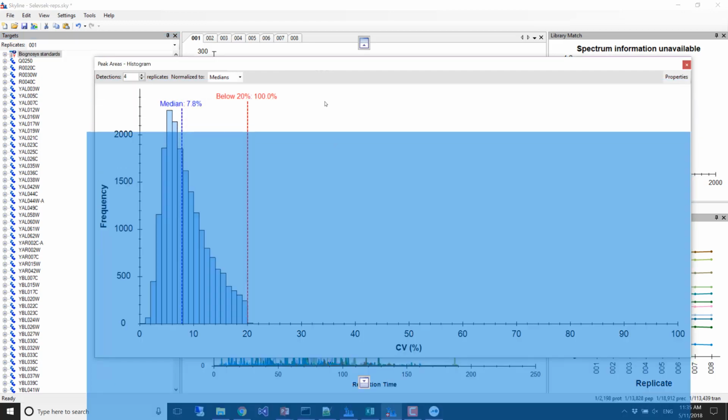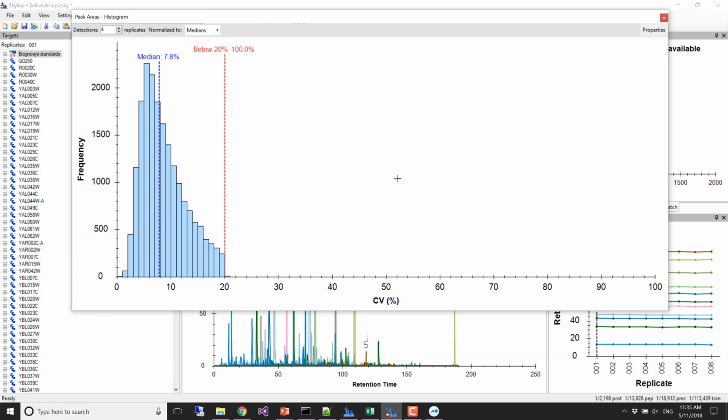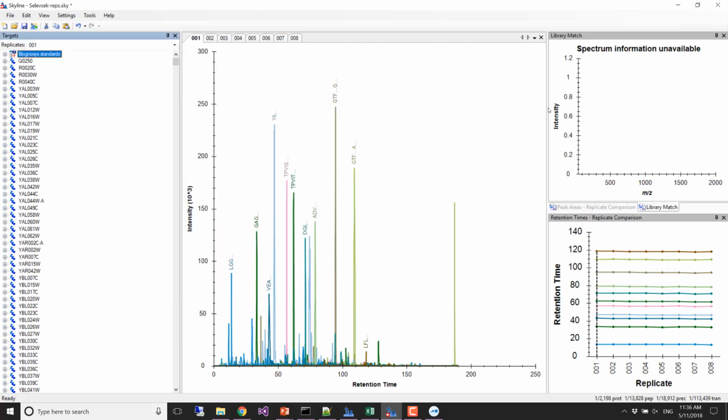So that's how we build a document that has, I mean, we lost a bunch of proteins, right? And we lost a bunch of peptides. But a lot of them were things we couldn't measure, and then the rest were things we couldn't measure reliably. So, and then finally, we could stop there. And in fact, I did stop there, but we don't have to.